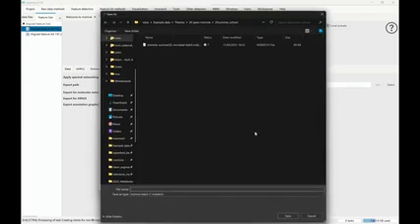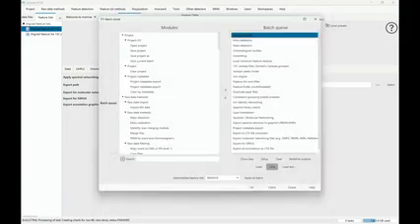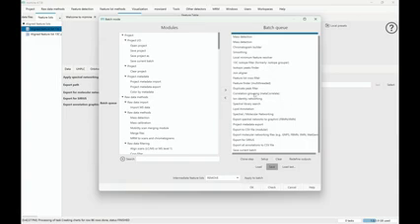So there's the save button here. You save it, you put it to your paper in the supplementary or in any other directory that everyone can access, and in there's the mzmine version, there's the version of every one of the modules, and then people can really reproduce what you do. And from there, we actually also have some export steps in here that already export this batch, because many people just forget. And so we basically added some steps as safeguards to make sure that you're actually exporting the correct batch file that was applied. We also export the metadata, but you can always just add more things. You can remove things from this batch, but save it and put it to your paper.